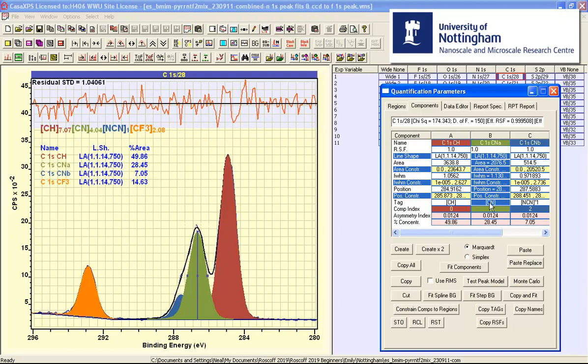And when you have made such a selection then pressing the test peak model button will simulate a sequence of measurements and then fit the resulting data using the peak model we see.